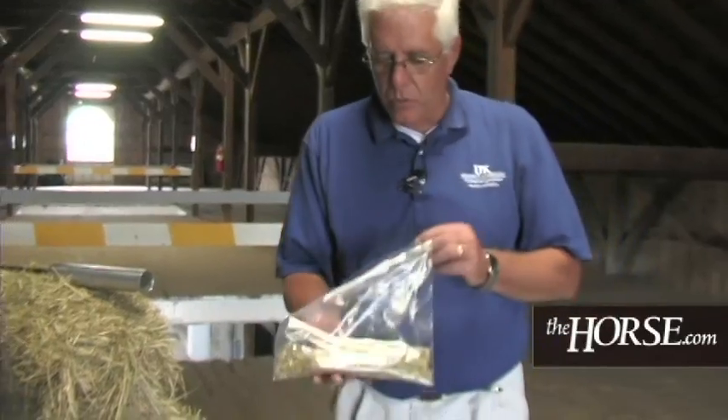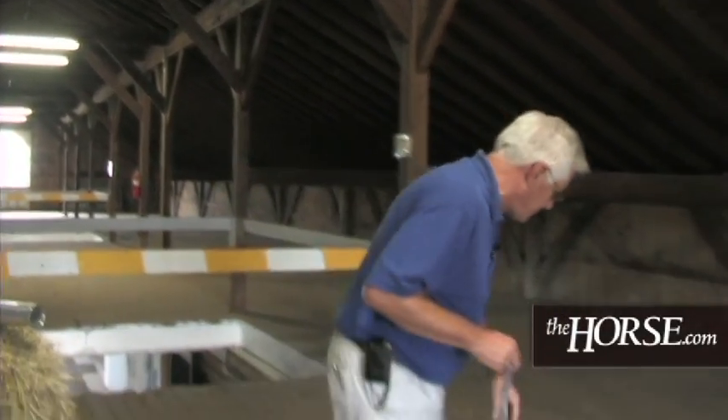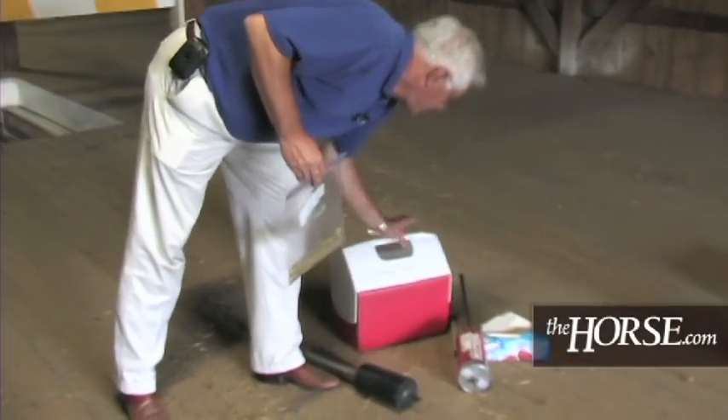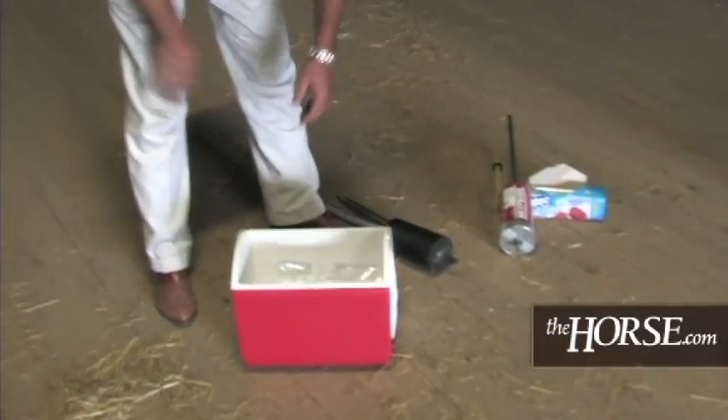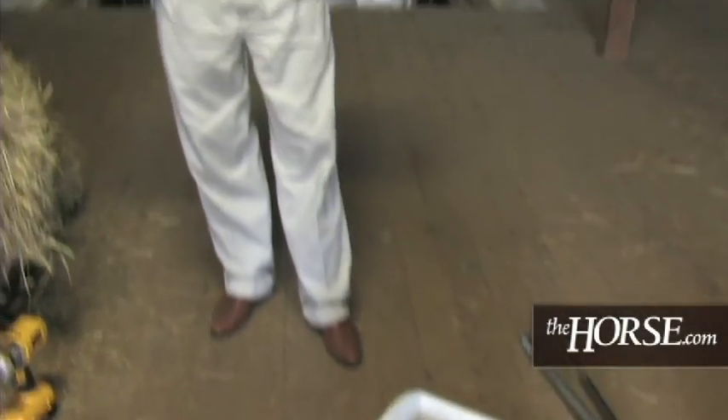Now we've got twenty cores in the bag — what do we do with this sample? The very worst thing we can do is throw it up on the dash of the truck. We've actually brought a cooler with some ice to put these samples in. This is not necessarily required at all times, but especially in the hot summer months it's good to keep these samples cool. The hay is cured out and those plants should not be respiring, but if there's some moisture and the sun beats down on it, it can affect your sample. Keep them cool and dry, and try to get them to the laboratory, your county agent, or your local feed store as soon as possible.